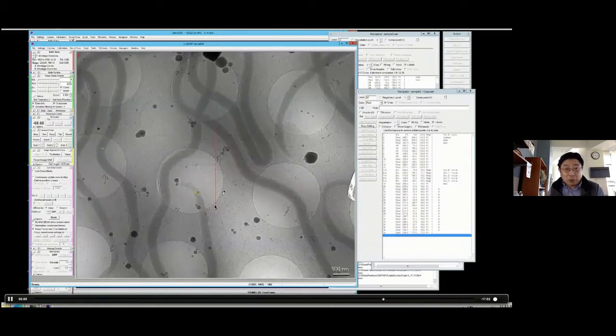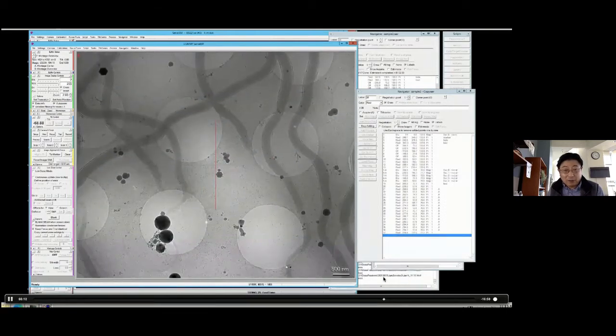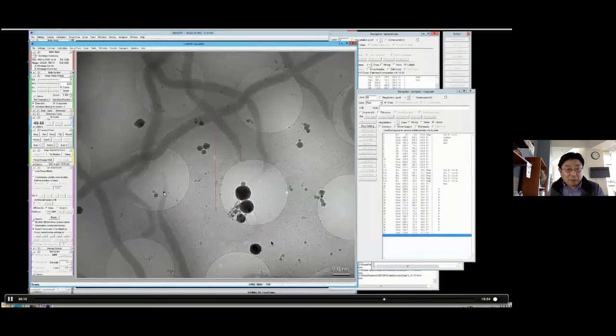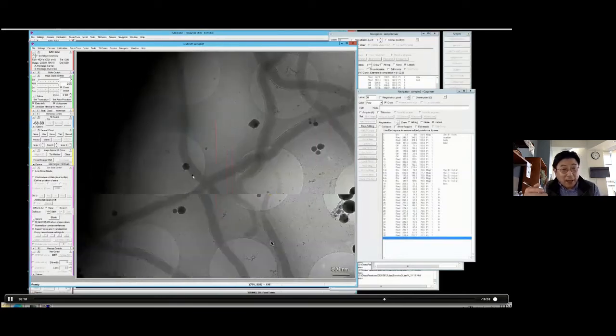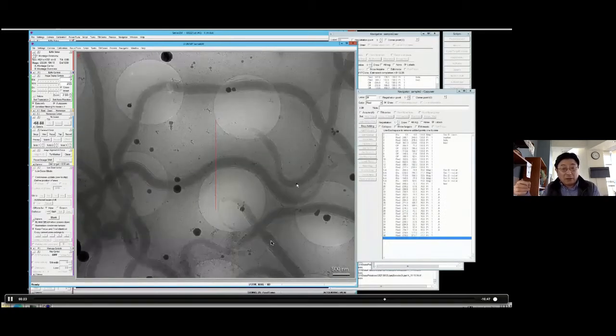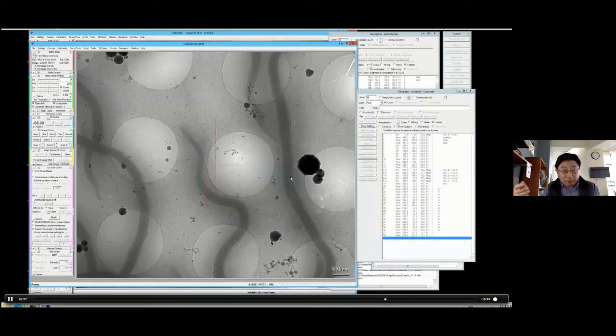Because you're not wasting microscope time, everything still operates in the background. You just add more samples, and based on the feedback from the previous two data sets, you can make adjustments, including how to select better areas.